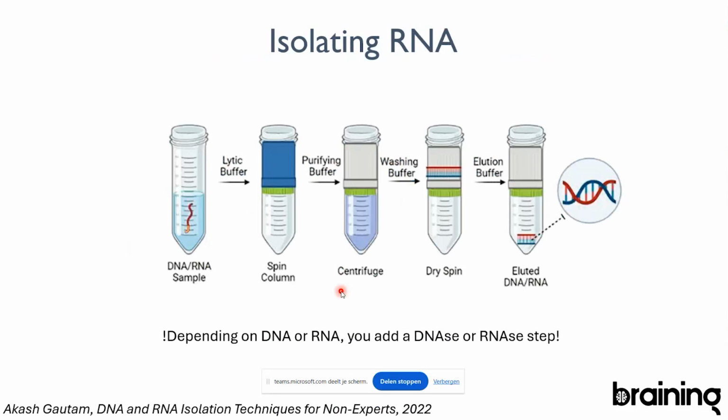Secondly, isolating RNA. There's no specific step for long-read sequencing. So it's the same type of RNA isolation as you would do for any other RNA sequencing method. So what we use in the lab routinely is columns.